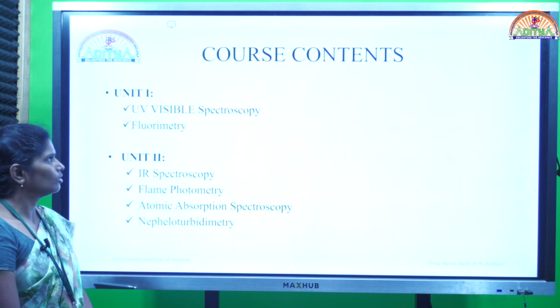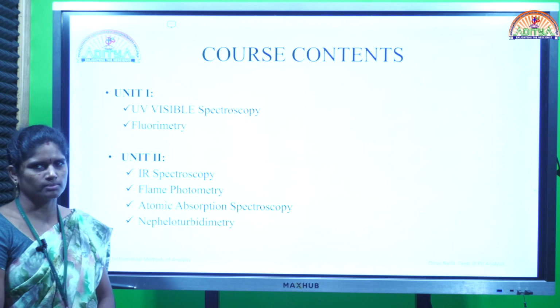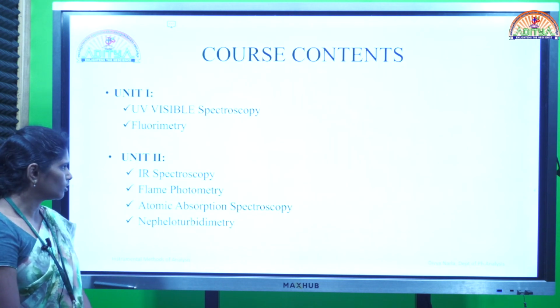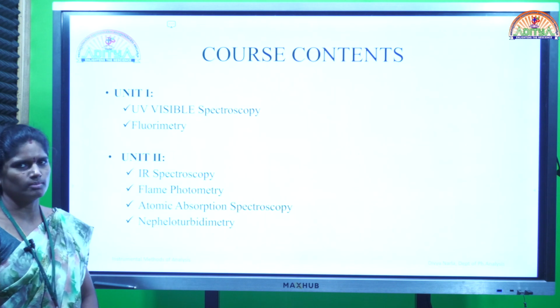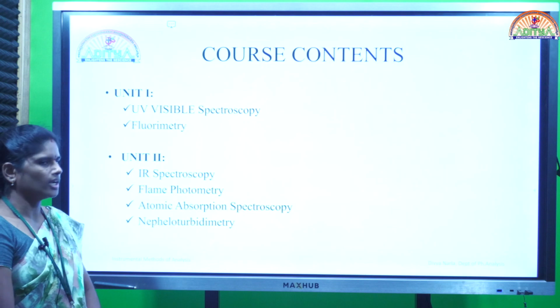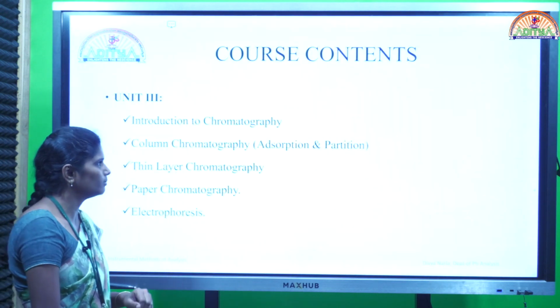So unit 1 of this IMA subject will be dealing with the spectroscopic techniques, particularly UV and visible spectroscopy, followed by fluorimetry. And the second unit will be dealing with IR spectroscopy, flame photometry, atomic absorption spectroscopy as well as nephelo-turbidimetry.